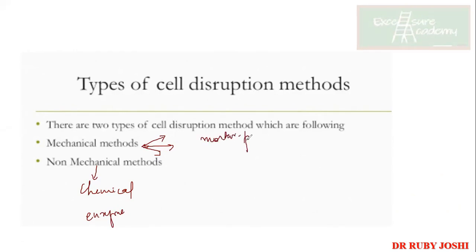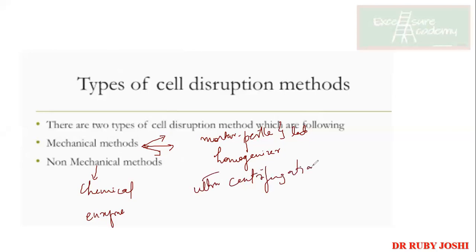Mortar and pestle is used in every lab. Then homogenizer, yes, very good. Centrifugation, it has to be ultra then. Then lyophilizer.